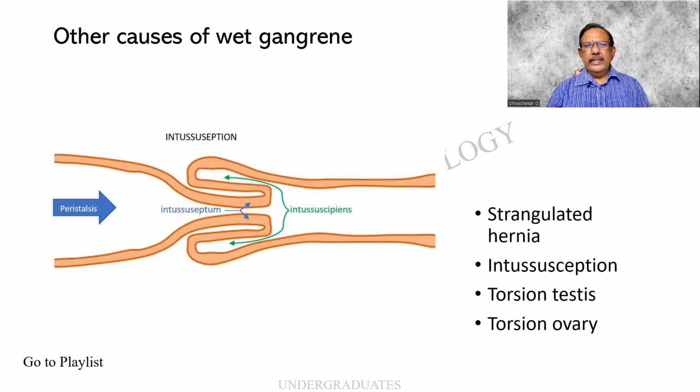But once he starts recovering, part of the intestine, see this region, it starts the peristaltic contraction. It keeps on contracting, whereas this area has not recovered. Therefore, it powerfully pushes itself into the distal segment. This is called intussusception. This loop of the intestine is called the intussusceptum. The entire lesion is called intussusception.